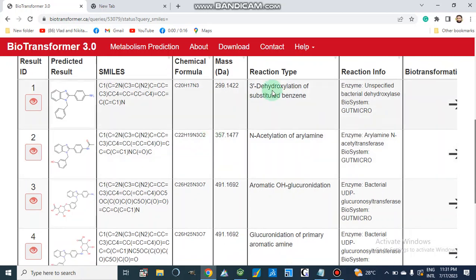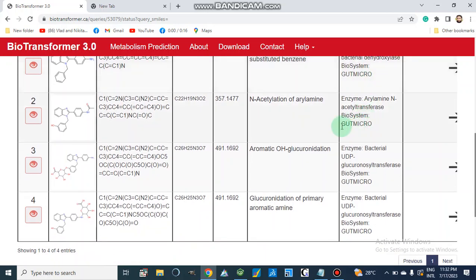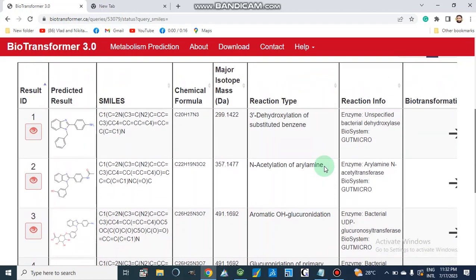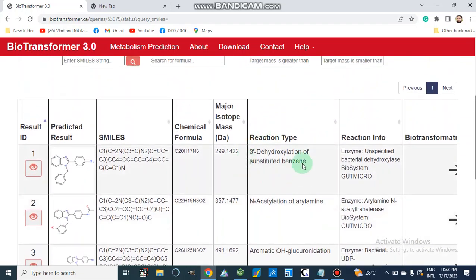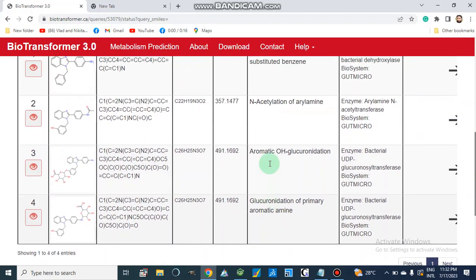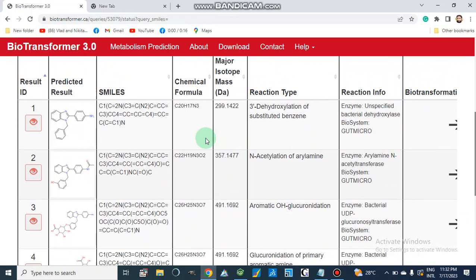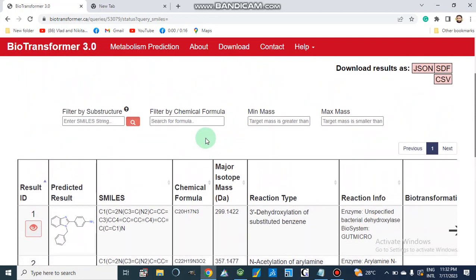The results show 3-dehydroxylation of substituted benzene via bacterial dehydroxylase in the gut microbial biosystem. Additionally, aryl amine acetyltransferase performs acetylation of aryl amine, and aromatic hydroxyl glucuronidation also occurs — these others are the same as in Phase 2. The key difference is the dehydroxylation of substituted benzene specific to the gut microbial system. In this way we can predict metabolism of our compounds.